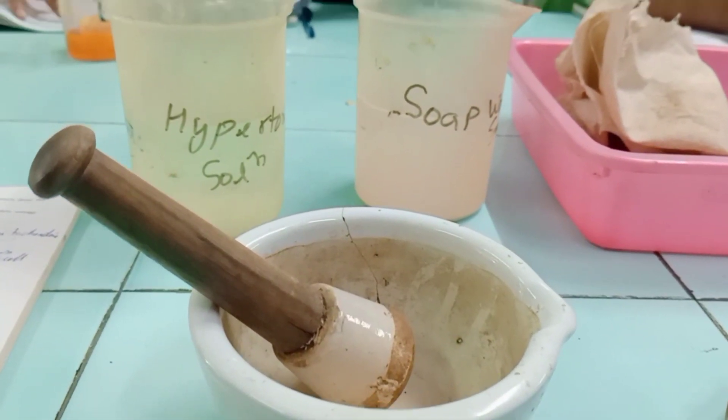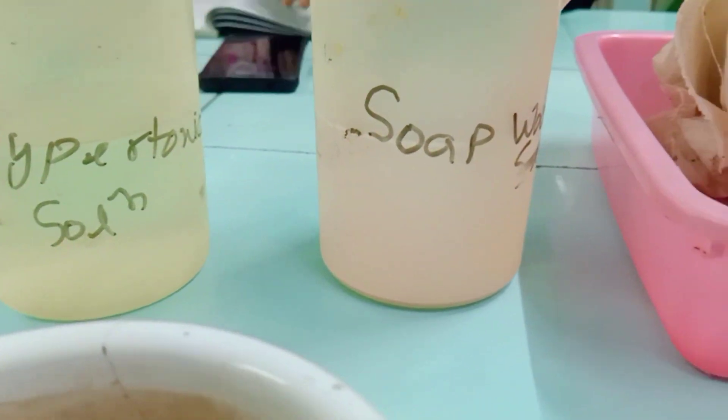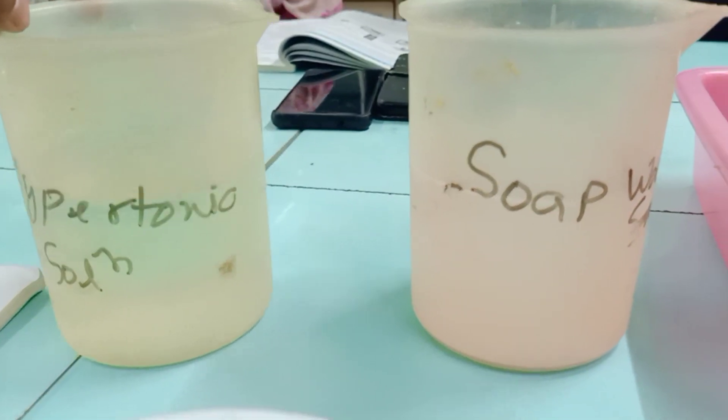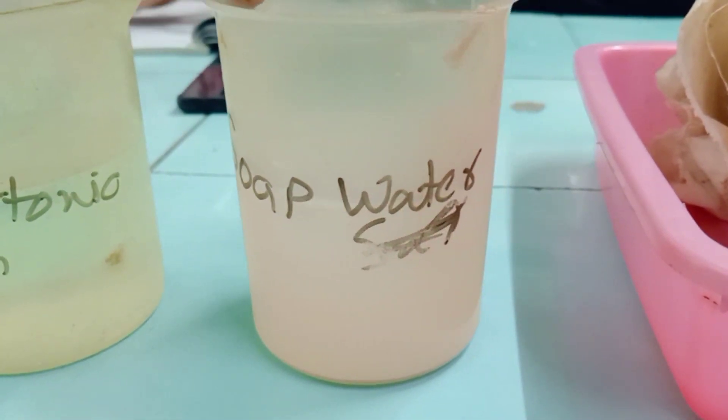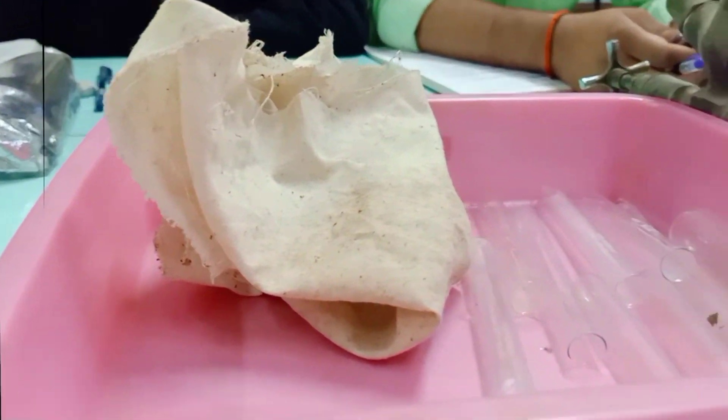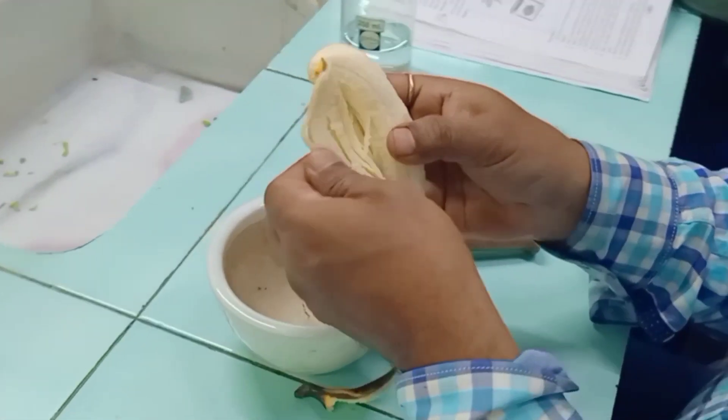For this we need a banana, a mortar and pestle, a hypertonic solution, soap water (that is detergent water), and a muslin cloth to filter the banana, and a test tube.